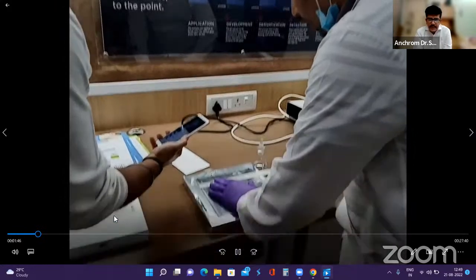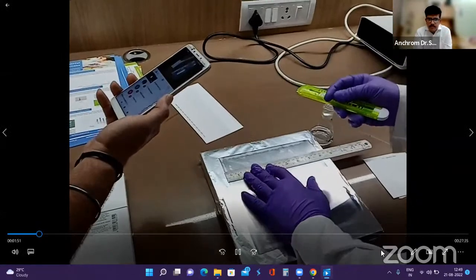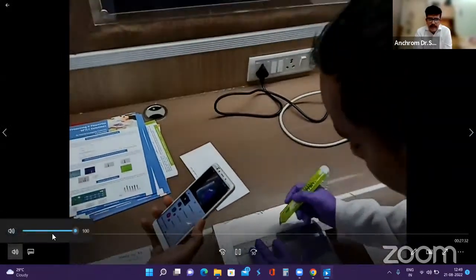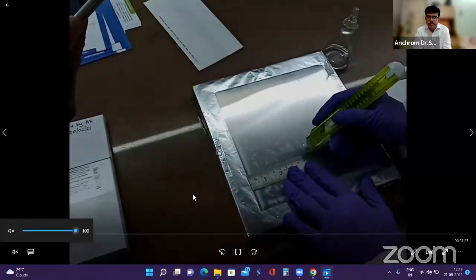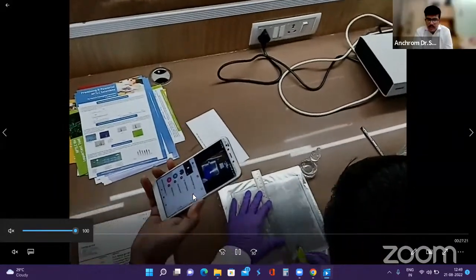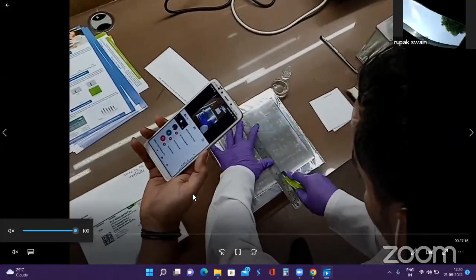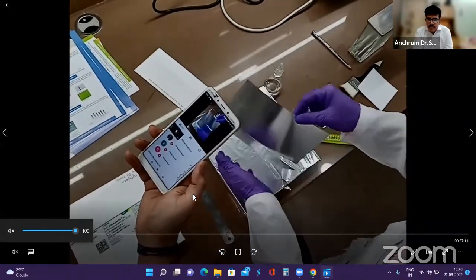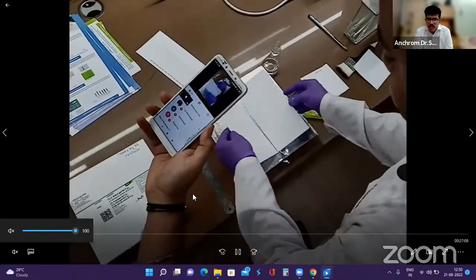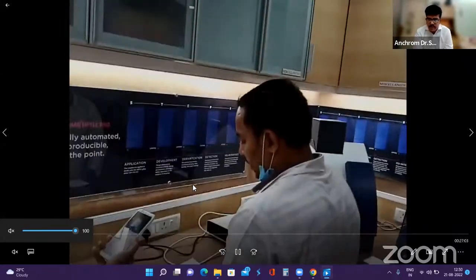What we do is typically take this plate with the help of a steel marker. We are marking the plate. Once this marking is done, we cut across by sliding in, to cut the plate into 2 halves. And there you see the aluminum plate that is being cut into 2 halves, which is ready to accommodate 2 sets of samples.